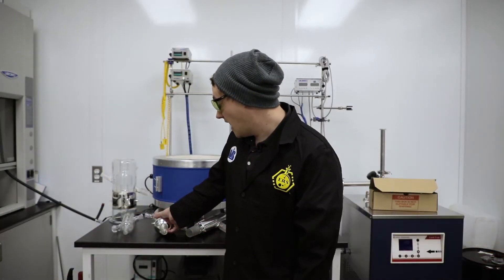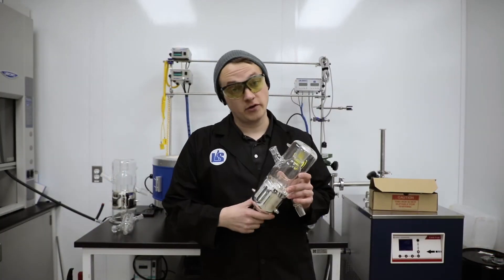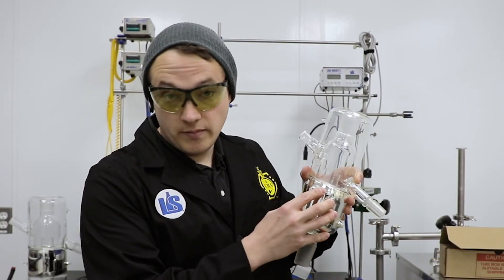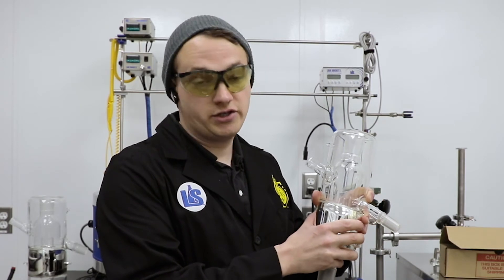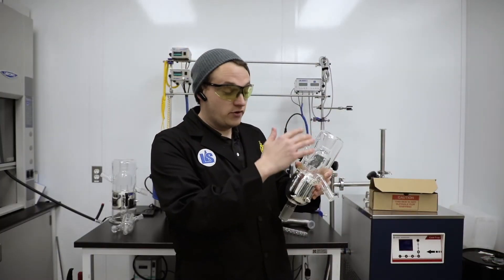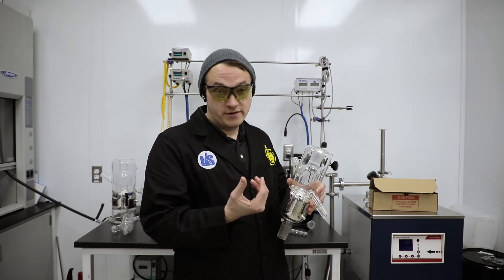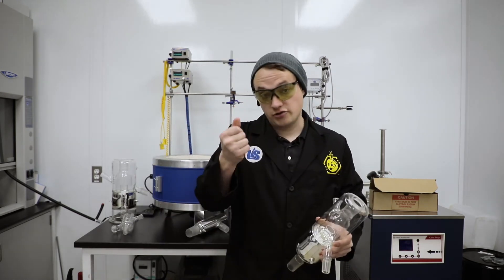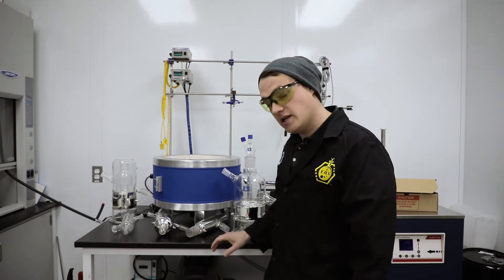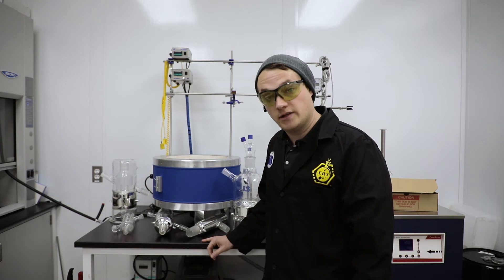That's actually how we were able to prove the concept of silvering originally. Using an IR camera, you can see that the parts of the heads that are silvered are relatively cold — you can actually touch them with your hands — whereas the non-silvered part is extremely hot. That temperature differential is what we're using at Lab Society as part of our patented process to trigger rapid condensation. This head is not currently available — we're still finalizing some testing and analytics on it prior to releasing it to the public.